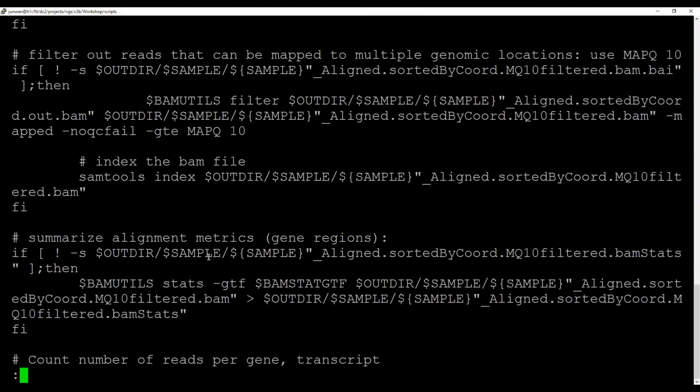After mapping, even if you find some reads can be mapped to a genome region, maybe the mapping quality is still not good, so it's better to filter out those reads that map to multiple genome locations or have very low quality. Here, we use MAPQ 10 as a cutoff, which is commonly used in many studies.